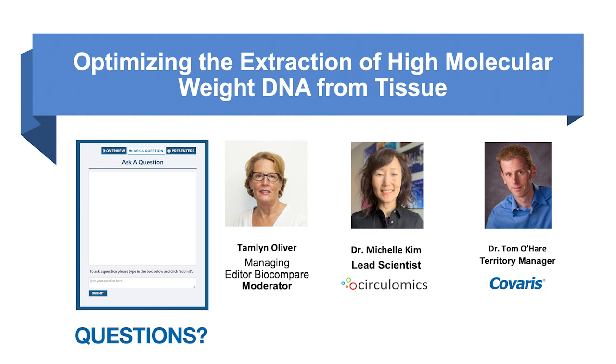Okay, thank you. And truly, this is the final question. All right, how much size will be used for extraction of DNA from human adipose tissue? Adipose tissue is tough because the cells are arguably big, and therefore in any sample, you won't have a lot of cells, you won't have a lot of nuclei, so you won't have a lot of DNA.